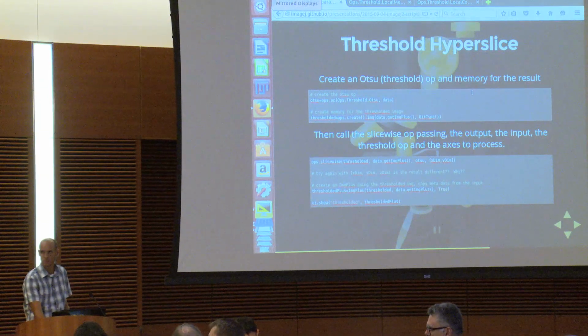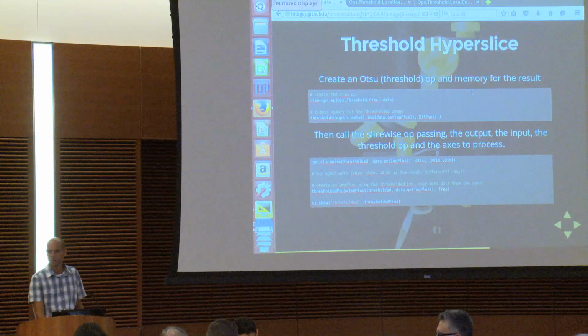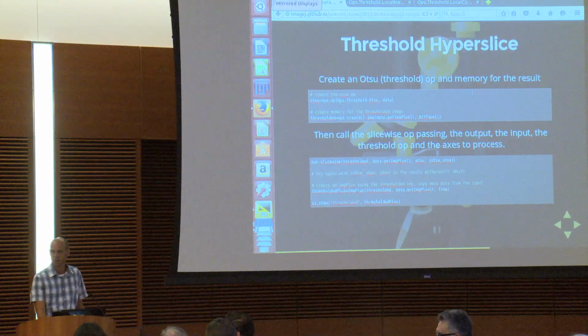For example, we have an op called the loop op, and it takes as input another op and the number of times you want to loop. Say you have an image and you want to add it to another image and you want to iterate this 10 times: you run the loop op and you fix the image you want to add 10 times as the fixed input.